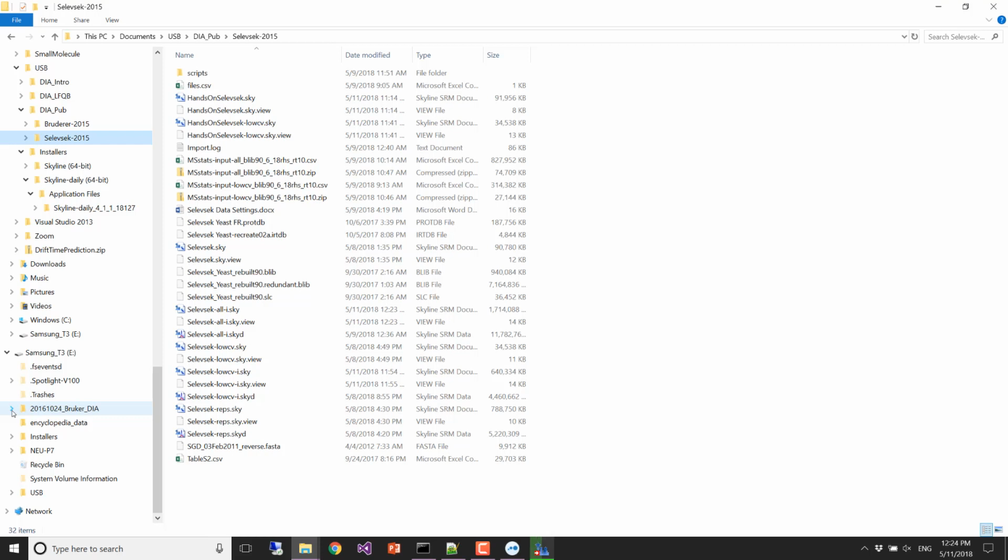The only other place we do it is in Zurich, and there ETH sets up virtualization. Everybody is working on a VM, and we still do small data. We still limit everybody. Even the virtualized hard drives, we can't give everybody 500 gigabytes of hard drive space.